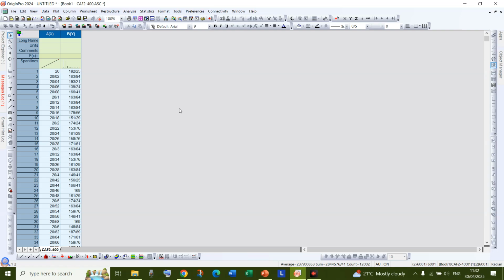In this video, we will talk about finding peaks in our XRD pattern. In the previous video, we talked about how we can plot an XRD pattern for our existing data. But in this video, we have to adjust some options to find peaks properly for our XRD pattern.